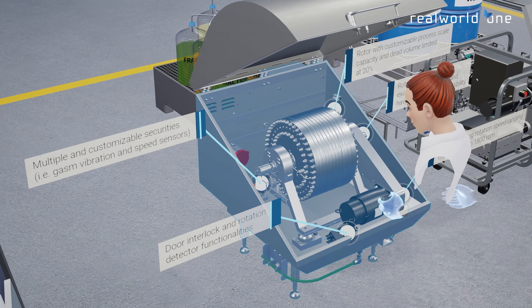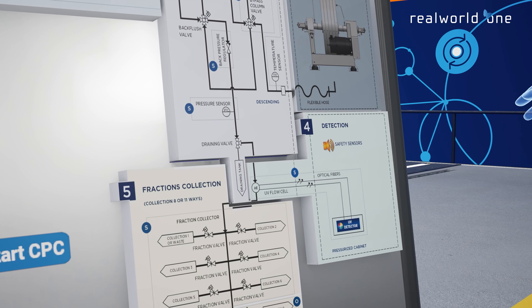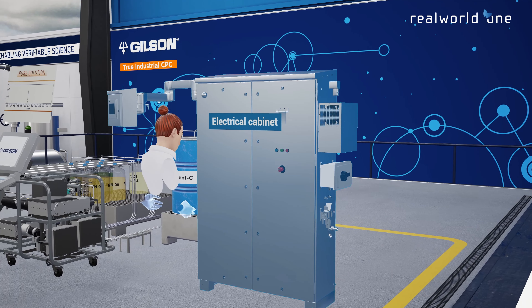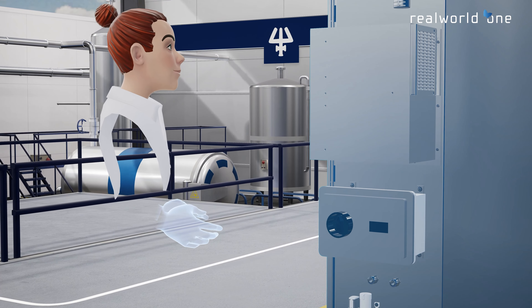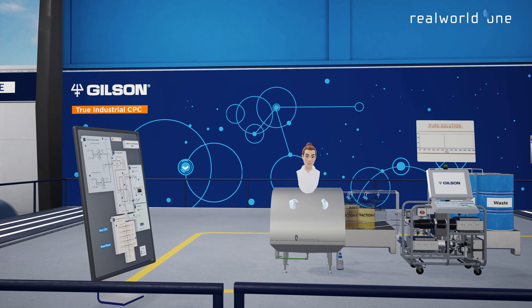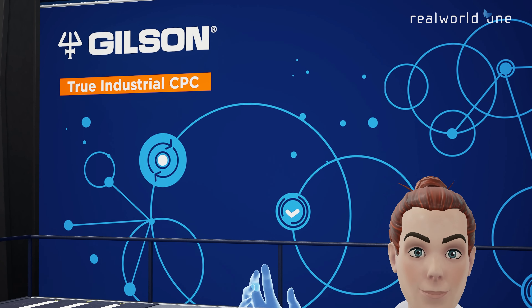Their pneumatic valves are resistant to physical and chemical strain. Developed with operational safety and compliance in mind, the ATEX certified electrical cabinet, as part of the Verity CPC Process System, is fully isolated from the rest of the SCID. Reach out to our experts today to discover how Gilson's Verity CPC Process System can help you in your industrial purification project.